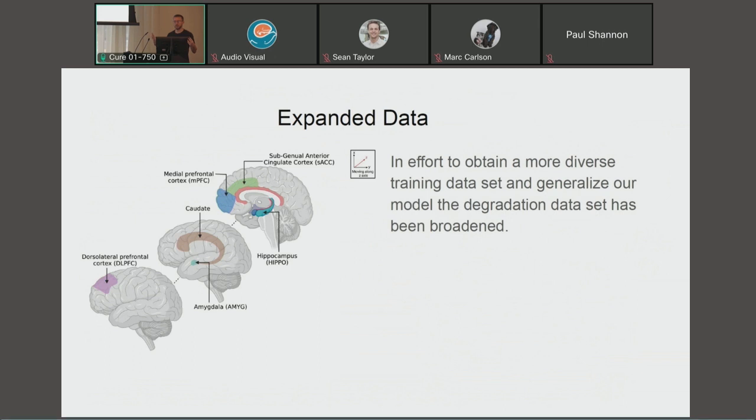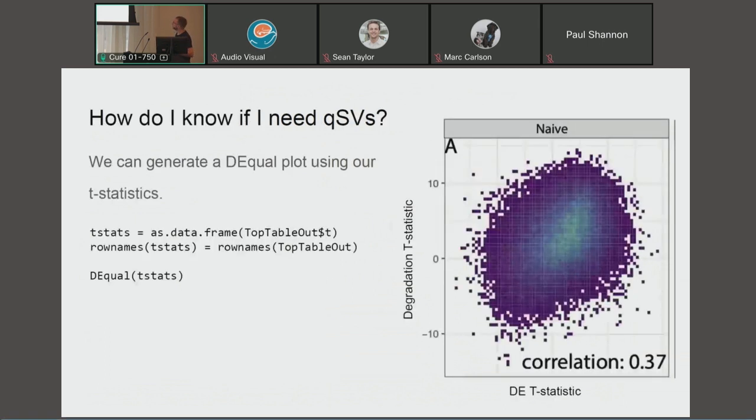I hadn't got far enough to test this in GTEx data yet, but that would be the gold standard. So how do you know if your data needs QSVs? The simple answer is I made an R package with a D-equal function. We're calling this differential expression quality plot. Essentially, if it looks like this, where there's a strong correlation, you should use QSVs. This function takes the output of top table and feeds the T statistics from your differential expression into a plot versus the T statistics from my degradation experiment. If those two are correlated, it means your data is confounded and you should explore using the qSVA analysis.